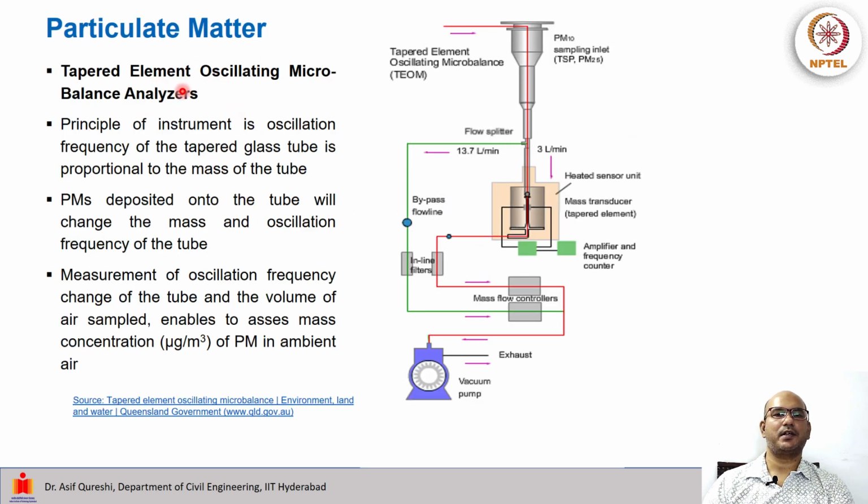Then we have the tapered element oscillating microbalance analyzer. The principle is that the oscillation frequency of the tapered glass tube is proportional to the mass of the tube.